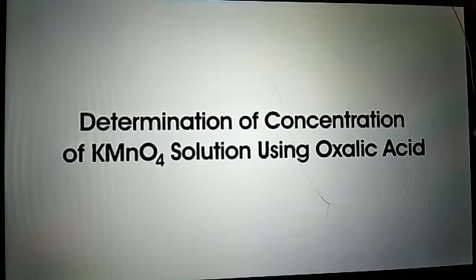And this is the video on determination of concentration of potassium permanganate solution using oxalic acid.